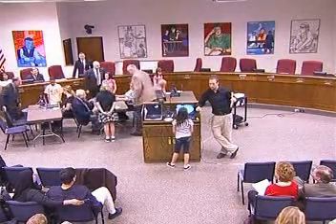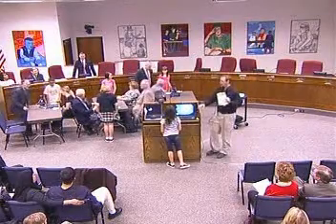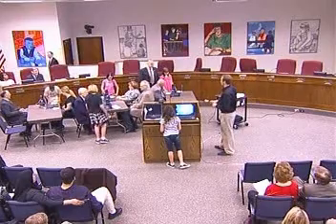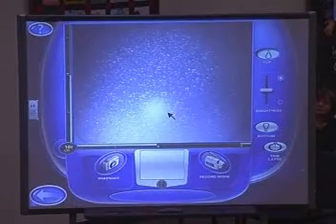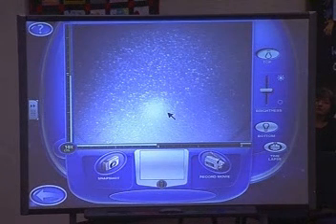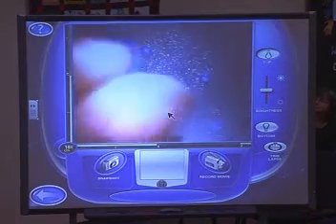When we get set up here, we're going to take a look at the last of the instructional strategies that we use every day at Brock Road, identifying similarities and differences. Again, we're going to take a look at sugar. Kids, if you would show them the sugar, get the sugar set up on the microscopes. That sugar, the blue stuff. It's blue because there's lots of little white powders on my setup here, and I didn't want to get confused.